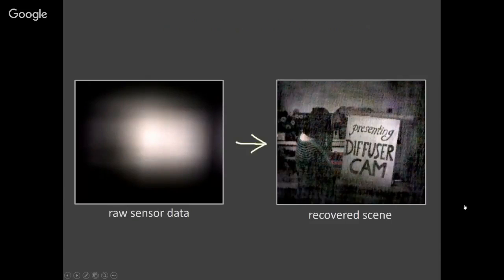which is why it's still a not too ill-posed inverse problem here. And I can give you a lot of arguments why this is actually a very good point spread function to use, because it's distributed, which means you can do all kinds of stuff with the multiplexing, but it also has really sharp edges. So the spatial frequencies that exist in those caustic patterns are diffraction limited spatial frequencies.